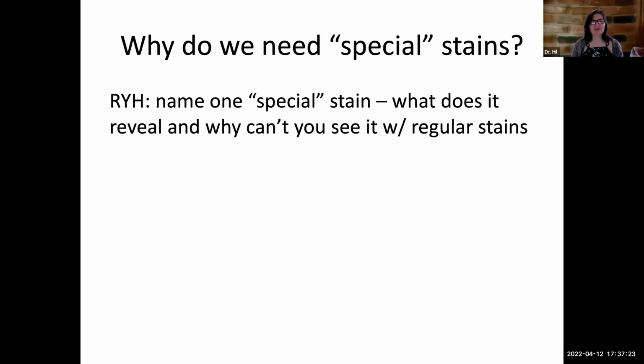Why wouldn't you see it? Because it's dark. Well, you're on the right track. It's because it doesn't retain dye. Exactly. So the capsule isn't going to show up. But if you do stain the background and the cell, then it does show up as a halo around the cell, just like you're saying, because it doesn't take up dye. Yeah, exactly. Okay, great.